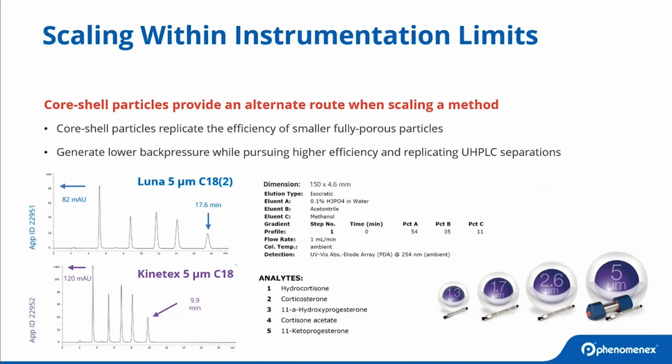So now we have a chance to revisit 2 chromatograms that we saw earlier. When using core shell particles, you don't necessarily have to use smaller particle sizes. You can use the same particle sizes with which we are accustomed and achieve sharper peaks within shorter runtimes.